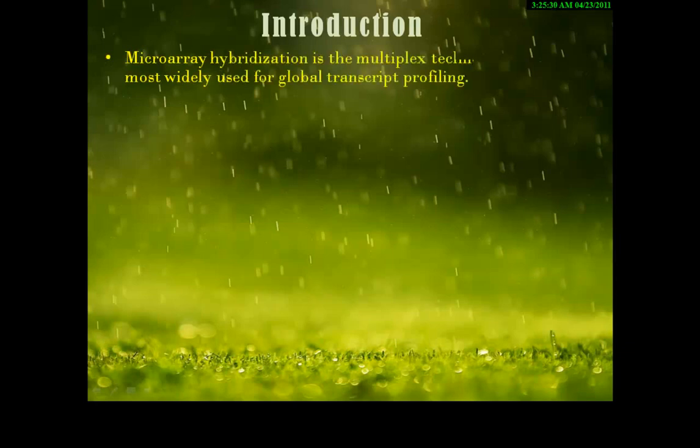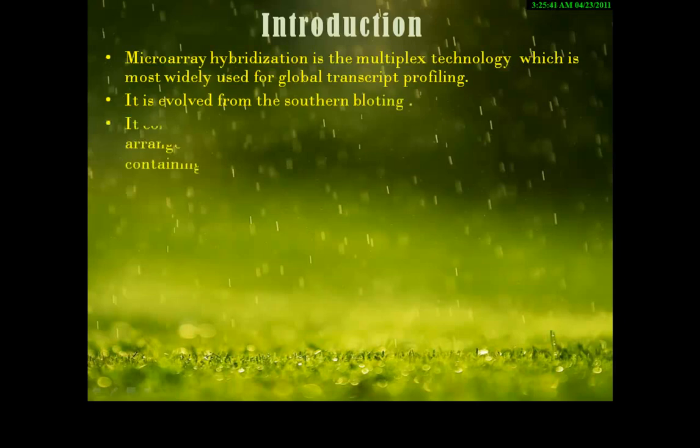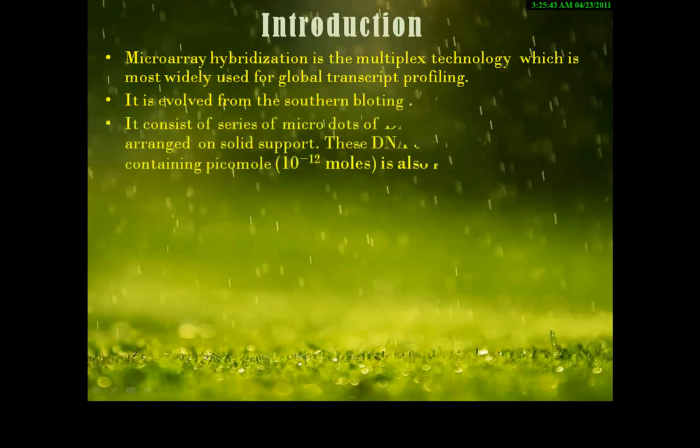Microarray hybridization is the multiplex technology most widely used in global transcript profiling. It evolved from southern blotting. Microarray technology consists of a series of microdots of DNA oligonucleotides arranged on a solid support. These DNA oligonucleotides are also known as probes.